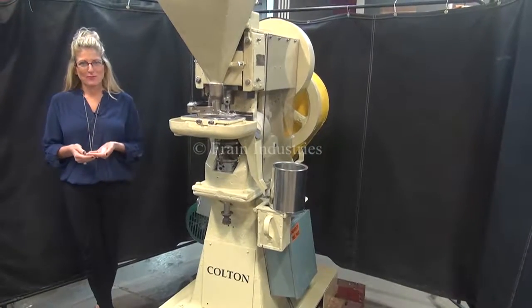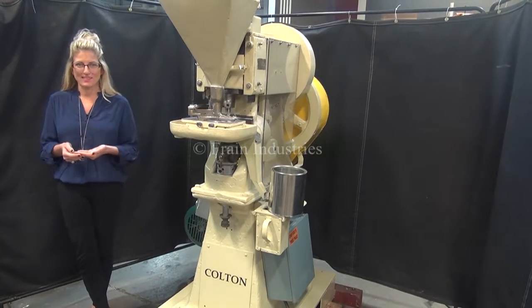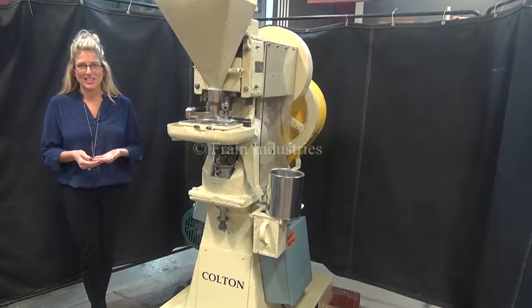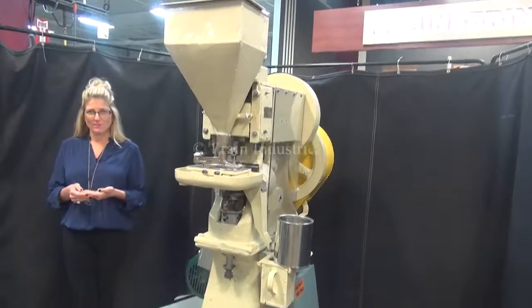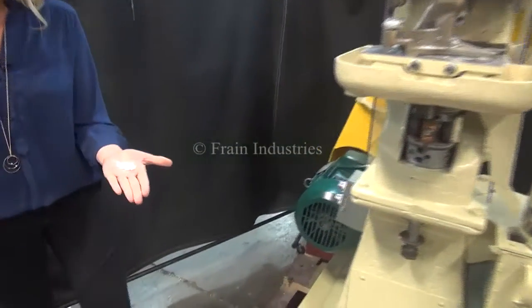Hi, I'm Katie with the Frain Group. Today we're cycling your Colton single head tablet press. We recommend you read the manual in its entirety before powering up the machine. The voltage is currently set to three phase 240 volts. Today we'll be creating these 500 milligram tablets at 50 tablets per minute.